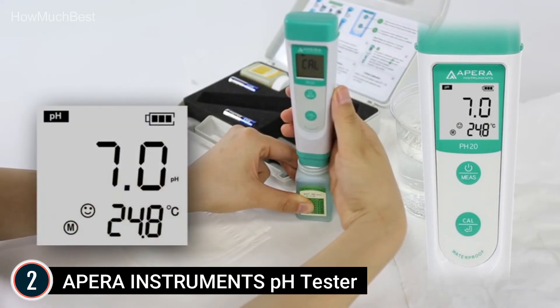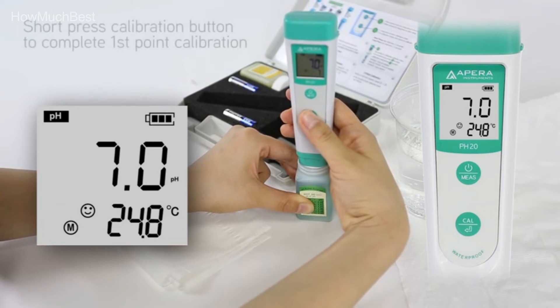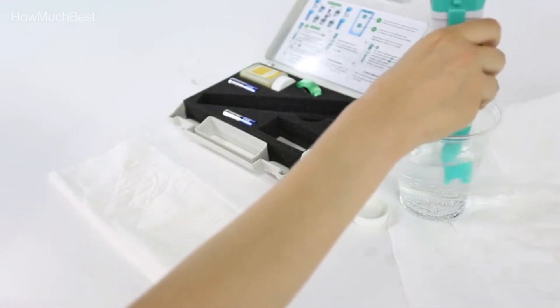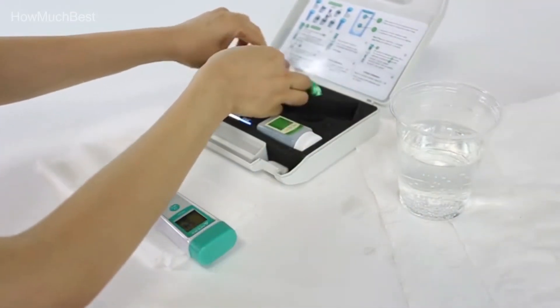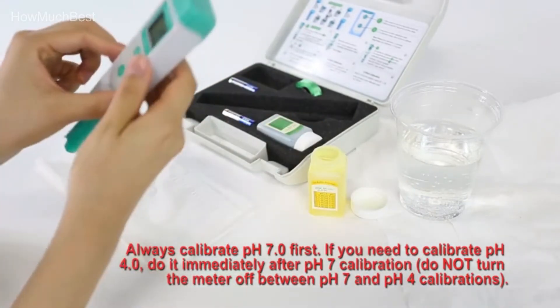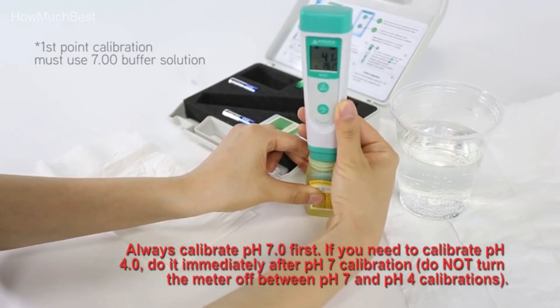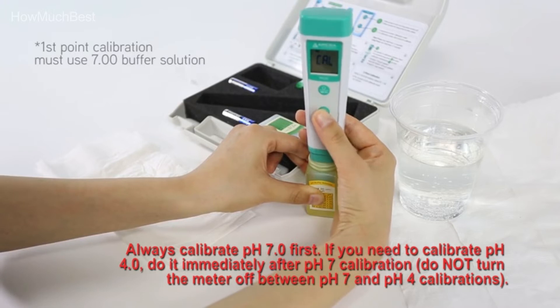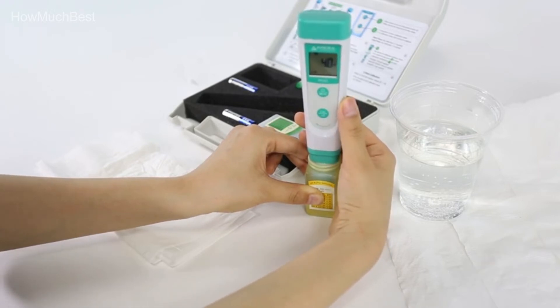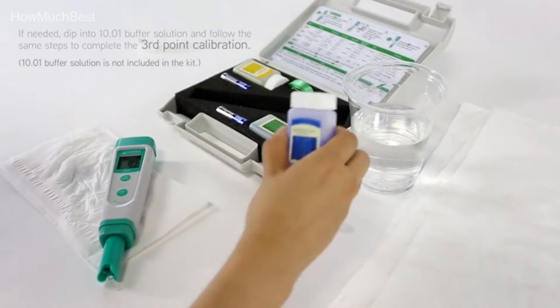Up to 3-point auto-calibration and 0 to 50°C auto temperature compensation (ATC). 0.1 pH precision with 0 to 14.0 pH measuring range. Auto recognition and indicator of stable values improve repeatability. The pH 20 kit includes a full set of pre-mixed calibration solutions of 4.00 and 7.00, four AAA batteries, and a lanyard, all in a portable carrying case. Smart self-diagnosis warns of incorrect buffer solutions and incorrect calibrations.